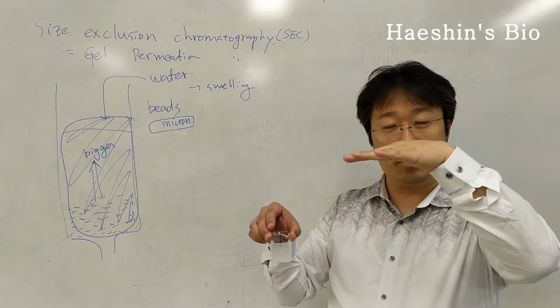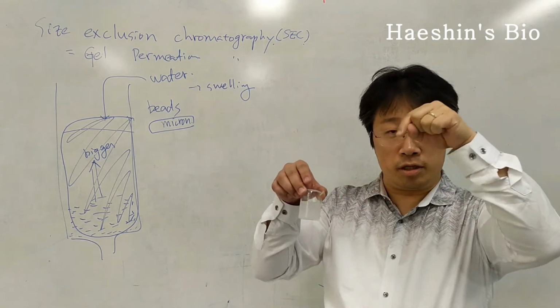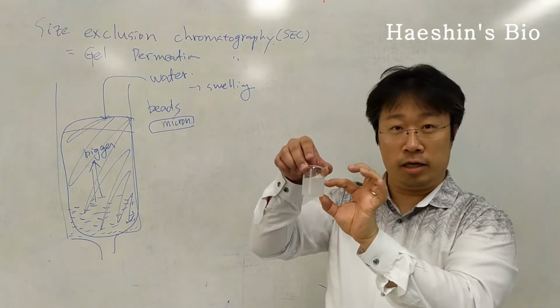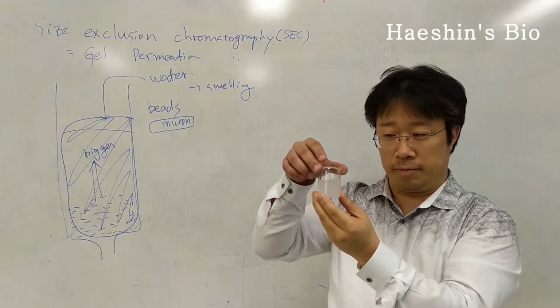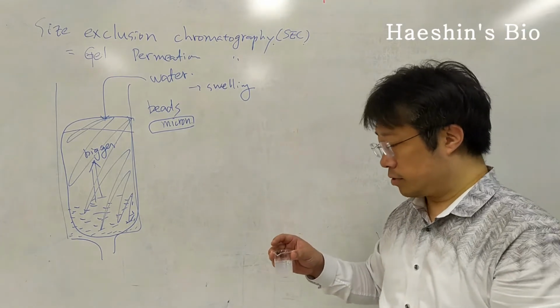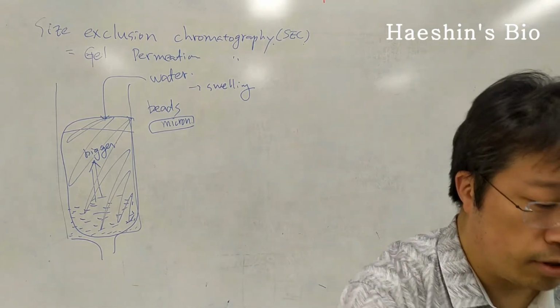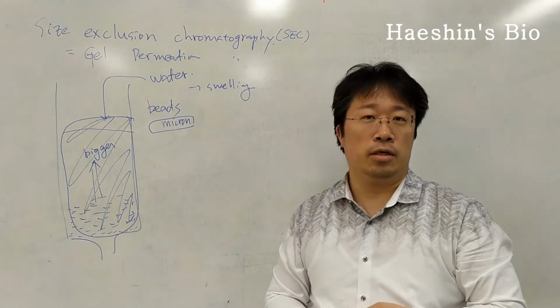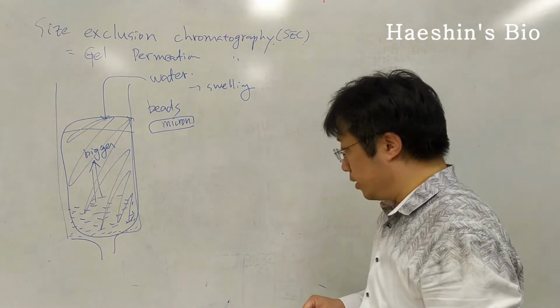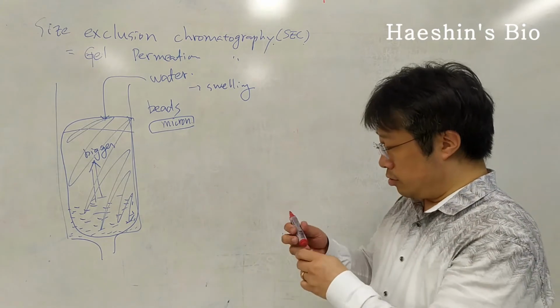They settle down slowly. Individual particles go down and pack, making hydrogel-like layers, as you will see. I'll put this aside, and in a minute you can see how they look.